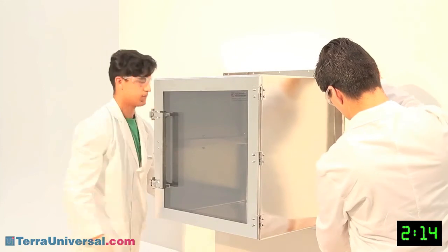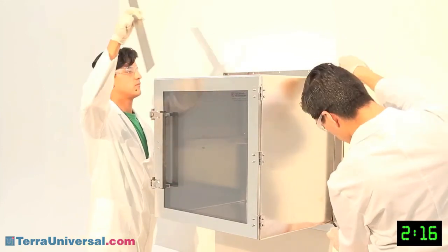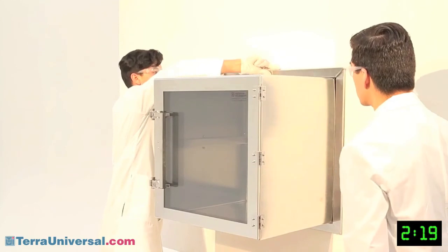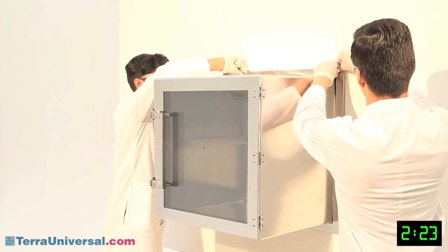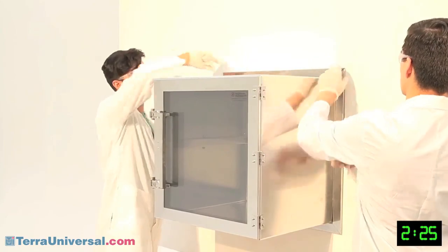This ease of installation points to another plus to the Clean Seam Plus. If a chamber ever needs to be replaced, you can do so within two and a half minutes with minimal disturbance to clean room operation.